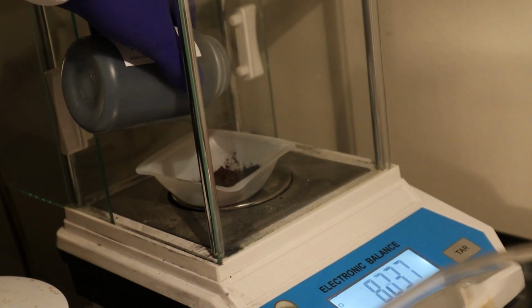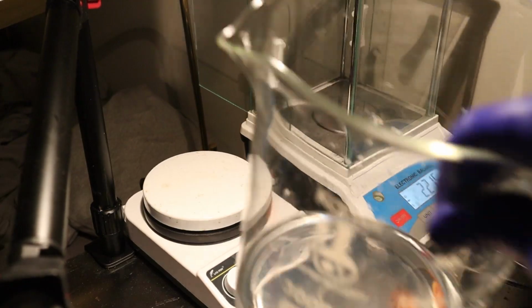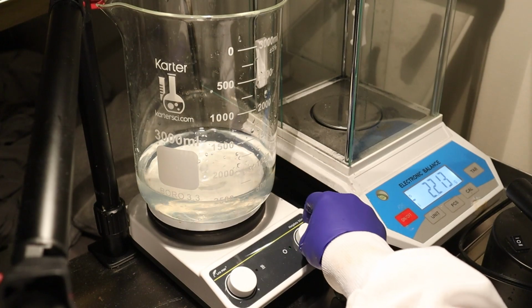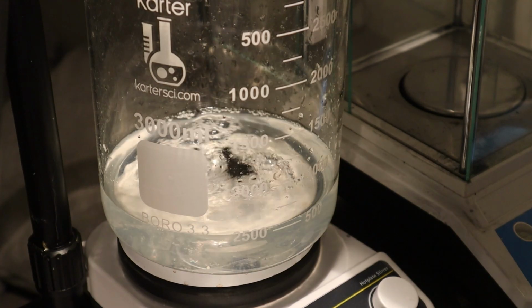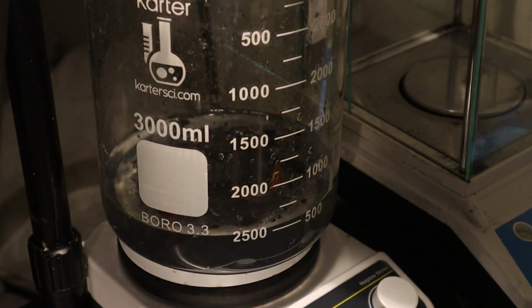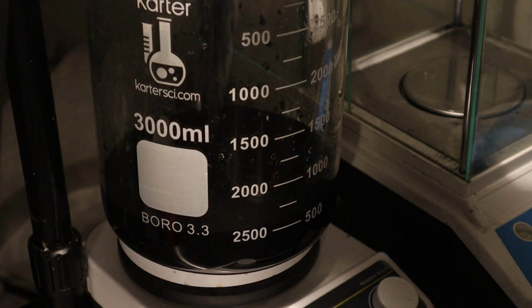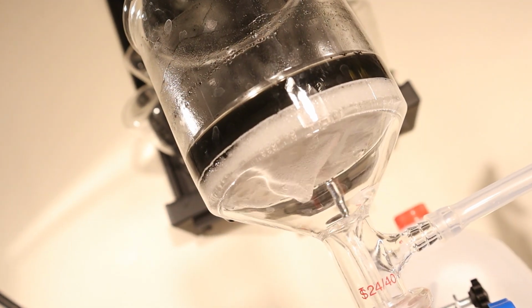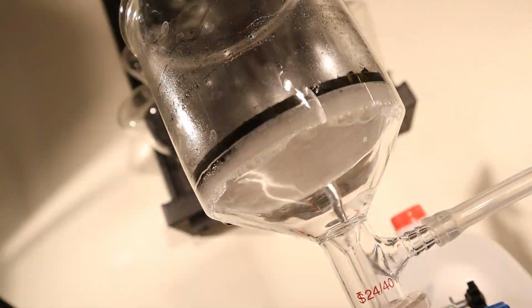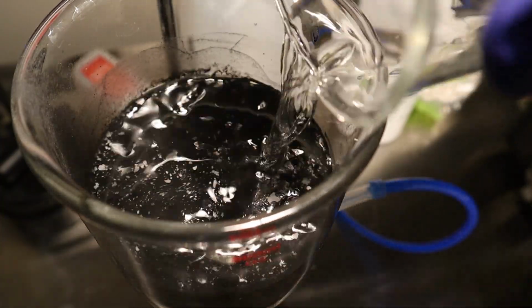The next step was another charcoal absorption, which required 4% activated charcoal instead of 1%, so I weighed out 20 grams of activated charcoal and did another charcoal absorption for 30 minutes. And then after filtering off a fresh, dry charcoal bed through the Buchner funnel, I ran 160 mils of distilled water through it, and then 160 mils of neutral methanol through it, as instructed in the method.